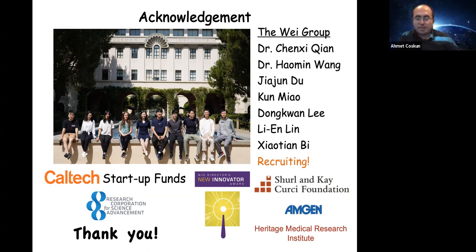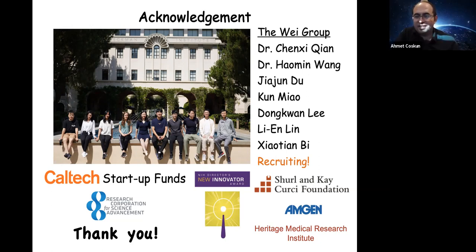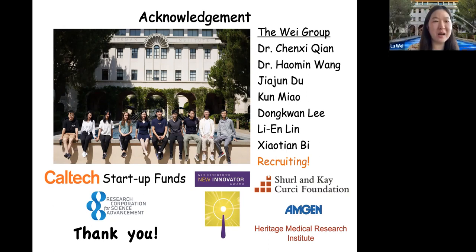Totally, because this is in situ, right? They have been characterized to look at the endogenous elemental or isotope signal before labeling. Then those channels were used to label, right? Your endogenous signal should be minimal or none, such that your new or specific one will give you the specific signal. That's right. That's why you want to choose your probe to be bioorthogonal. Otherwise it will be complicated by the endogenous percentage.